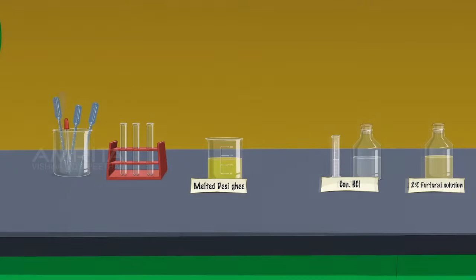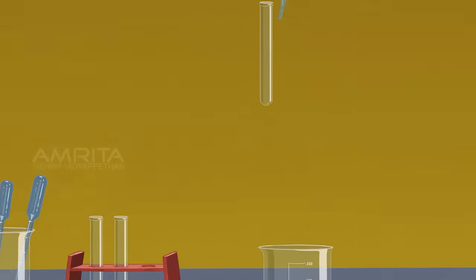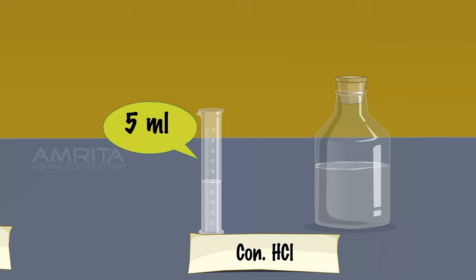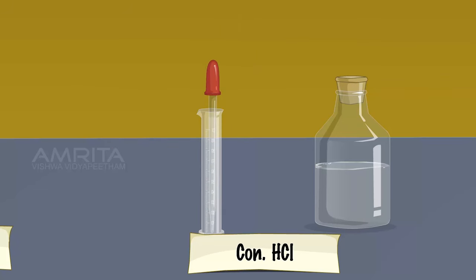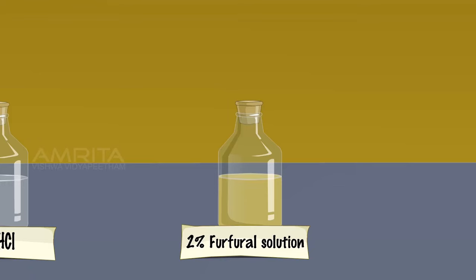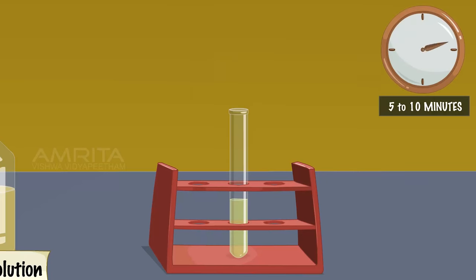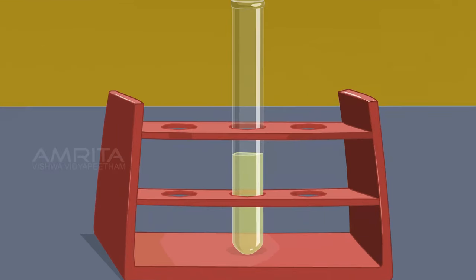Baudouin Test. Desi Ghee. Using a dropper, take a small quantity of melted desi ghee in a test tube. Using another dropper, add 5 ml concentrated hydrochloric acid into the test tube. Then add about 3 drops of 2% furfural solution into the test tube. Keep it aside for 5-10 minutes. There will be no characteristic change, indicating that pure desi ghee does not contain sesame oil.